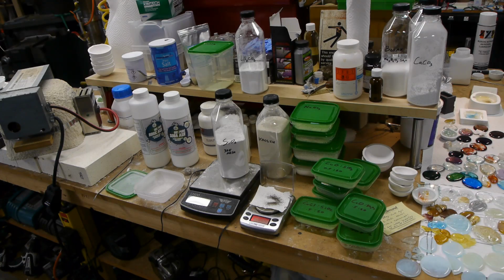What you really want to do is put it in a rock tumbler and run it for a day or an hour or something like that. And that will make sure that the powders are really, really well mixed together. And this is important because like we were talking about, the glass batch doesn't just all melt together. It's actually a chemical reaction that's happening in there. So you really want the powders to be in really well-mixed, intimate contact with each other so that the chemical reactions can proceed as smoothly as possible. If you've got a clump of something off in one corner of the crucible, it's possible it will eventually melt and make a glass for you, but it may not have the properties that you want because it didn't properly react with all the other ingredients.